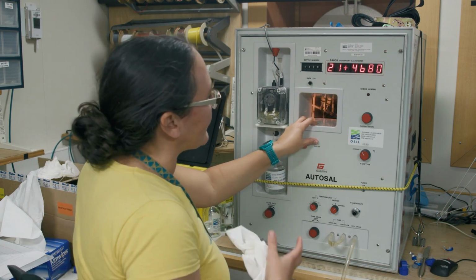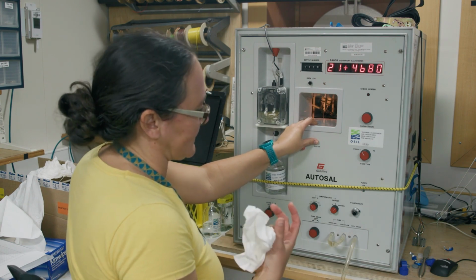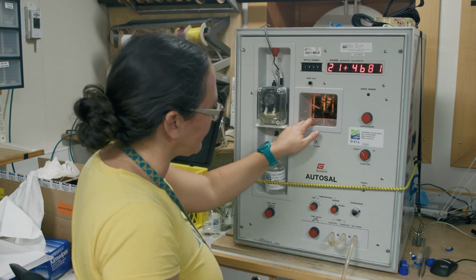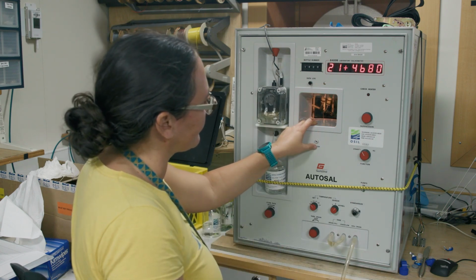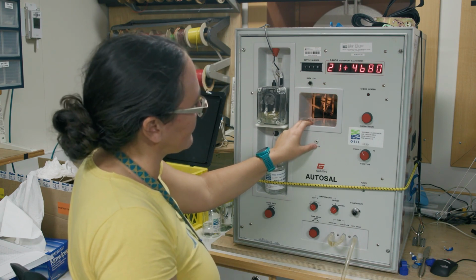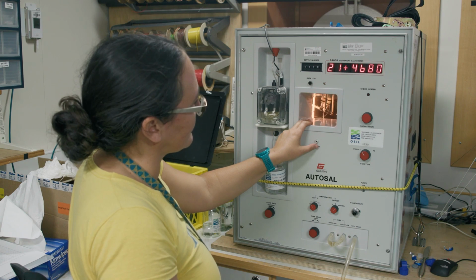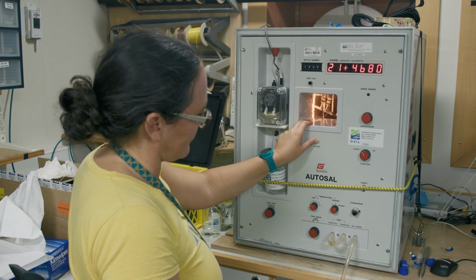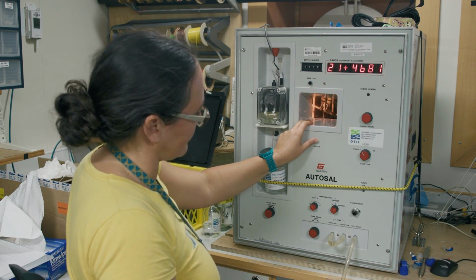Again, cover the flush valve and empty it, release, and let it refill. Repeat this flush and fill procedure a third time.